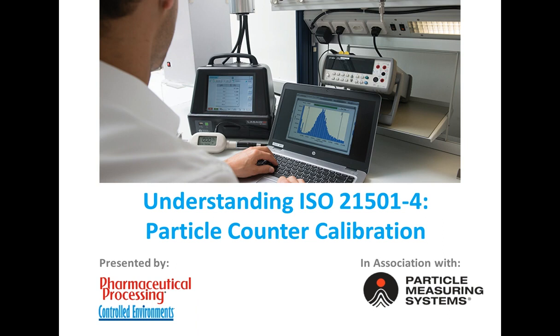Today's presentation is called Understanding ISO 21501-4 Particle Counter Calibration. ISO 21501-4 has two main goals: to improve instrument-to-instrument data correlation and count accuracy, and to enhance compliance with ISO 14644.